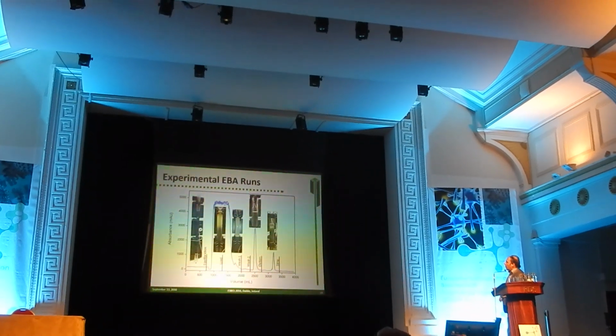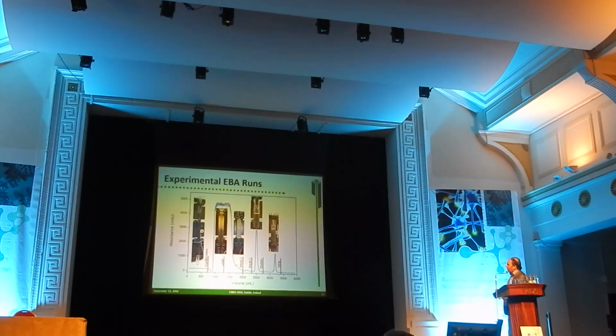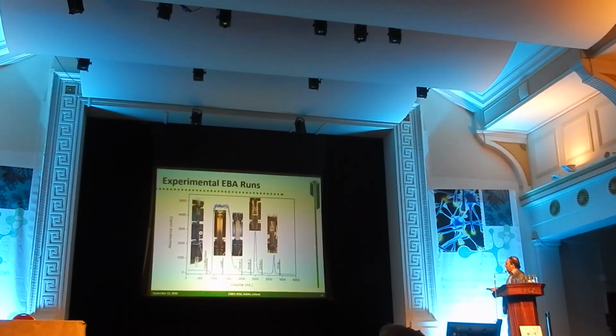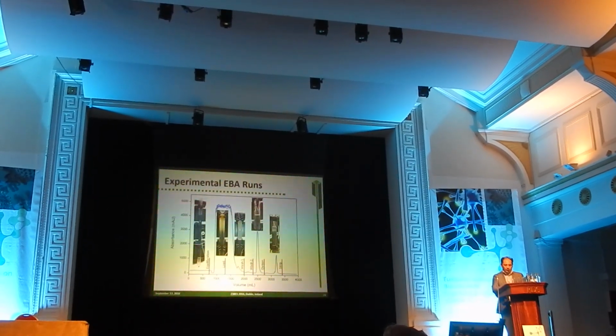And then we ran the whole cycle, so we went through the application of the sample, of the feedstock, 2 washes. There are 2 wash steps here, and finally there is of course the elution of the product.